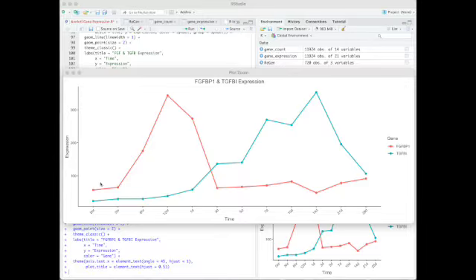FGFBP1 encodes for the FGF binding protein 1, which releases FGFs from the extracellular matrix, enhancing signaling and promoting cell proliferation, differentiation, and migration. FGFBP1 works with the FGF signaling pathway to aid in regeneration, acting as a substitute for nerve signals.